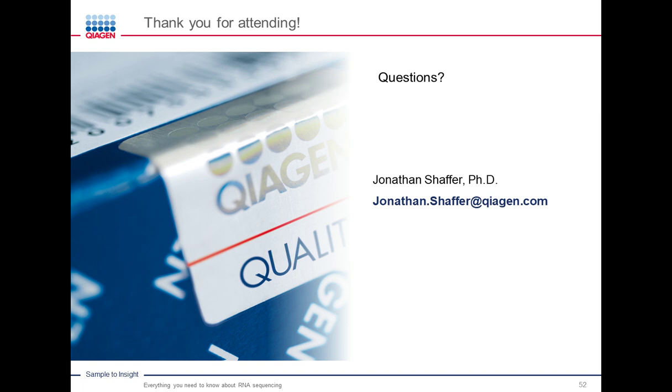Does the miRNA kit work with serum or plasma? It works with both. And this is a great question to ask because a lot of effort is going into microRNAs with serum or plasma now. I often get asked also whether serum or plasma should be used, and basically whatever you have access to, as long as it's all serum or all plasma. So I wouldn't recommend working and comparing serum to plasma just because they are inherently prepped differently.